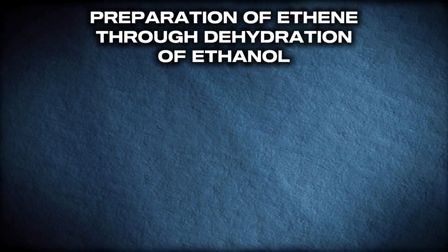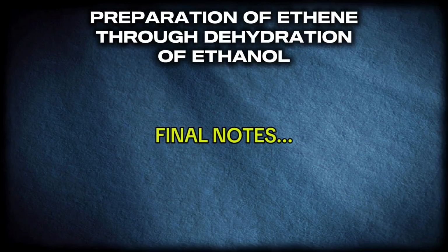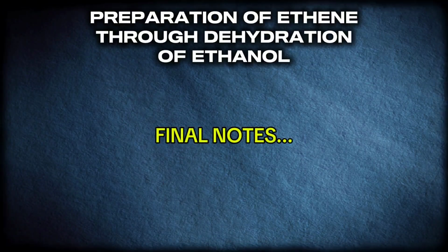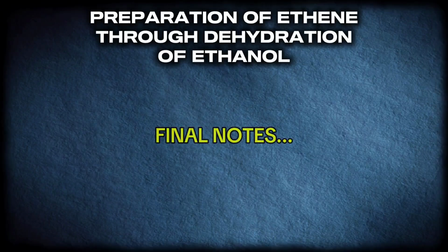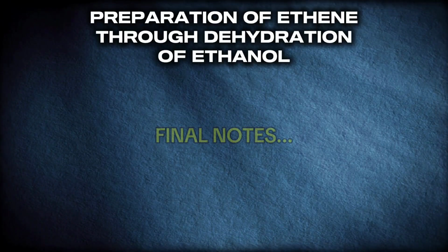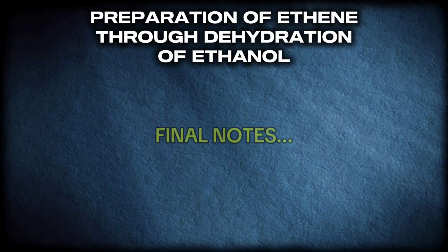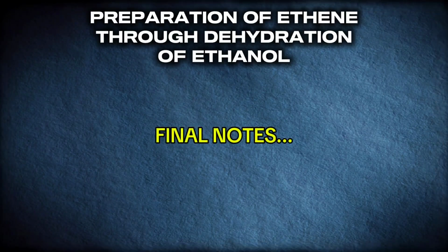in order to report this particular practical much more in a better way, don't forget, in this practical, you have to show the title, the aim, apparatus, reagents used, the equation of reaction, the result. The result is based on the observation you made. What was the observation you made when this reaction went into completion? So show the observation or write the observation you actually made.